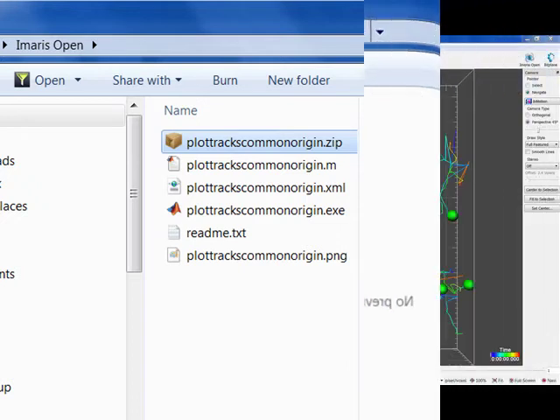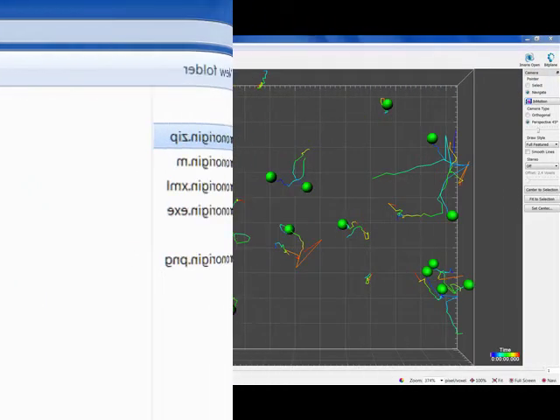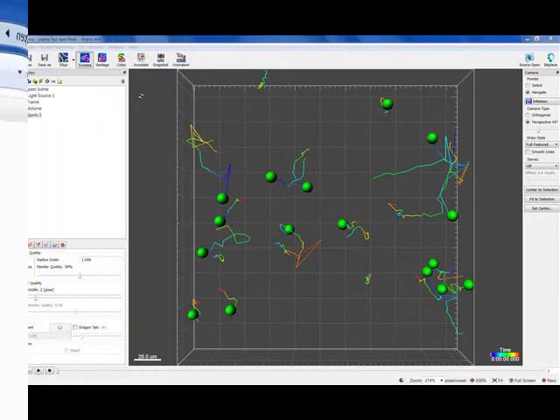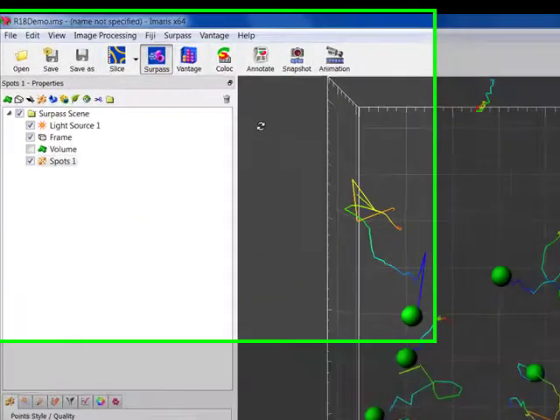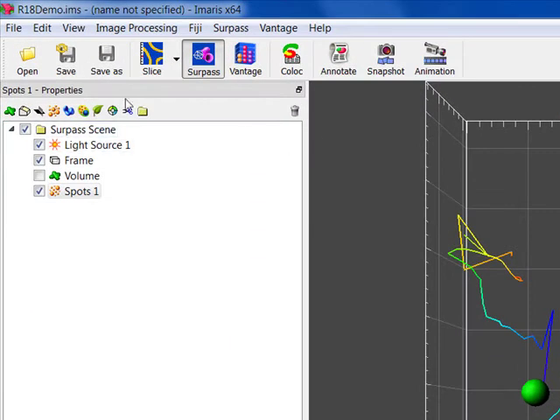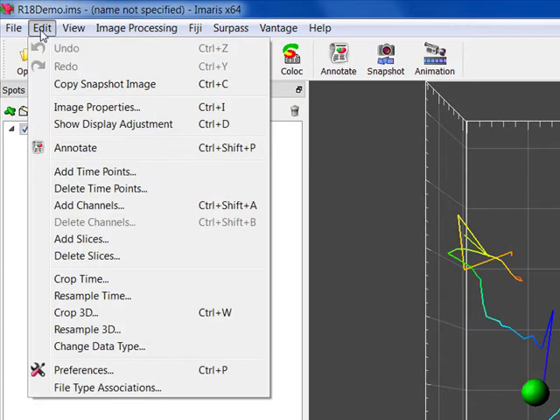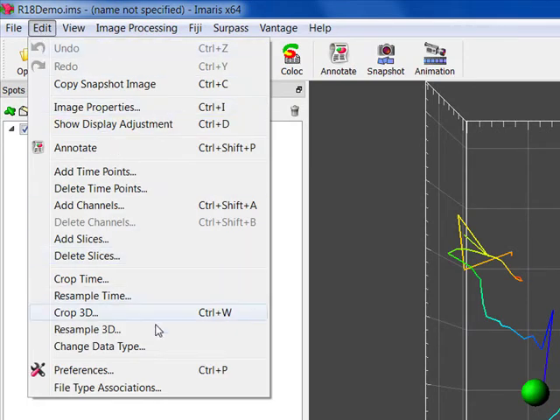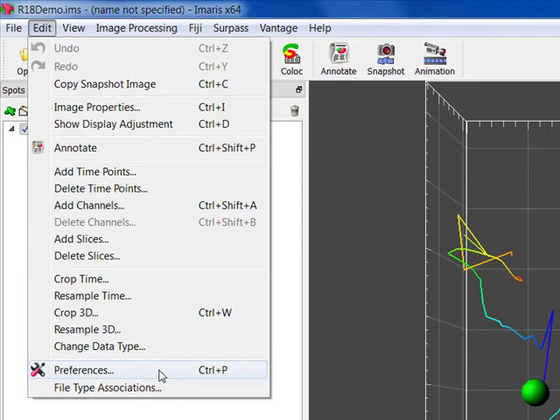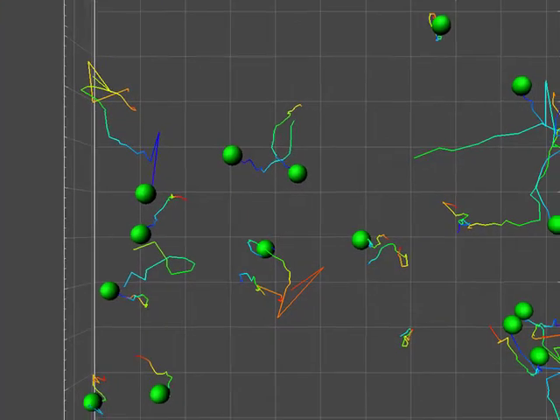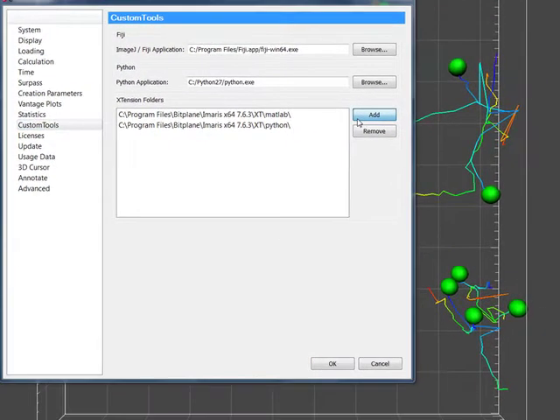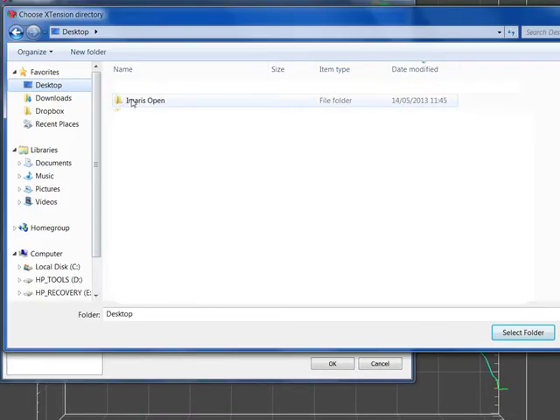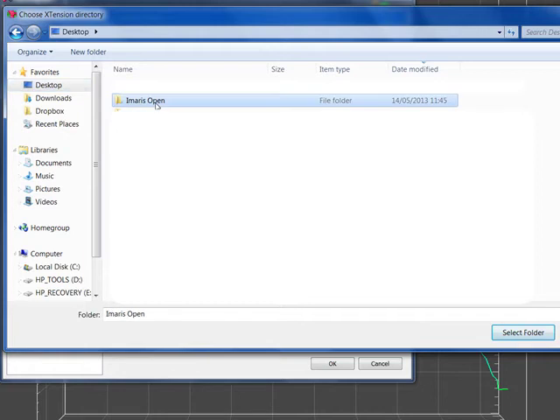The first step of integrating the extension within Imaris is to specify the folder with the downloaded extension file. To do this, under the Edit menu, select Preference and then choose the Custom Tools option. Under the Extension Folders option, click on the Add button. Specify the downloaded extension location to add it to the list of predefined ones.